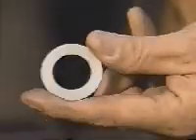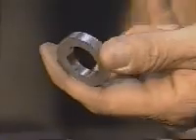Apply the final pressure necessary to compact the powder. Eject the test specimen from the die and measure its thickness.